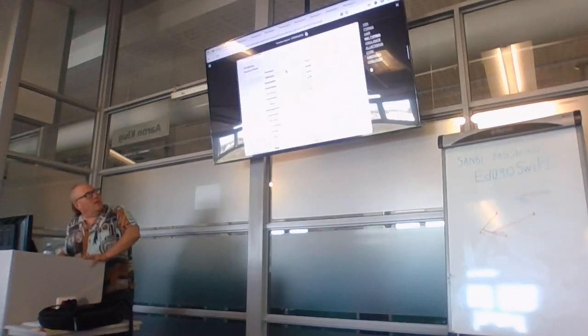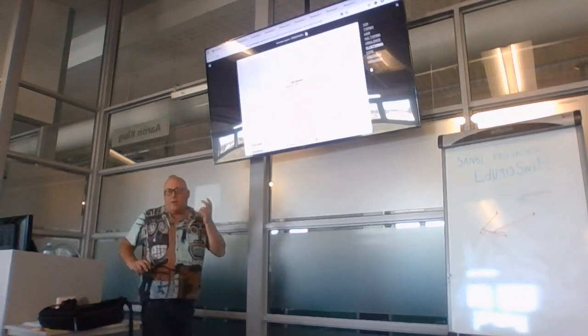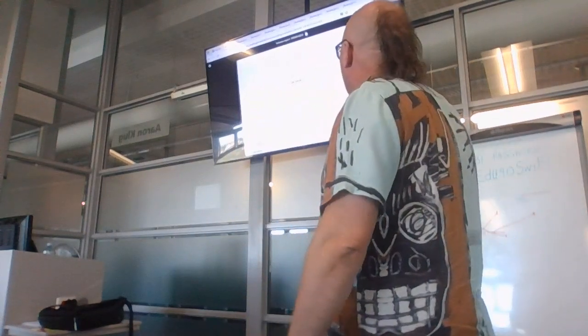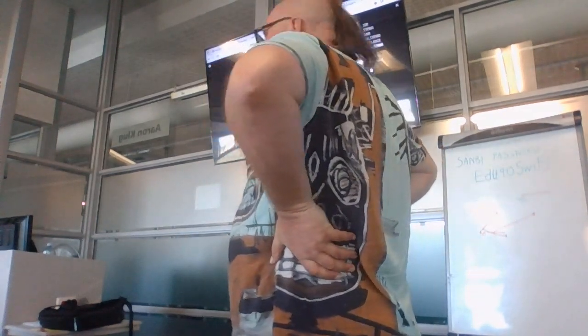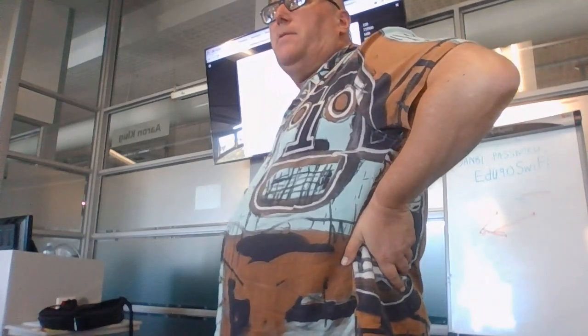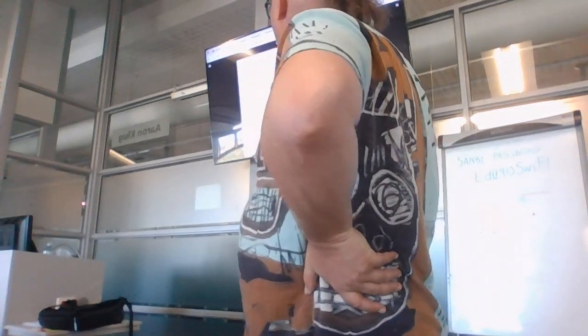it gives you a readout on the virulence genes that are identified, all of these cholera-related things, and down at the end, you can run clustering based on cgMLST, core genome MLST, to see what other samples there are in their database that are similar to your samples, okay? Some of these tools, I wish that we could run them outside of Pathogen Watch, but for now it's just queue position 500. So obviously a lot of people are hitting this website today.